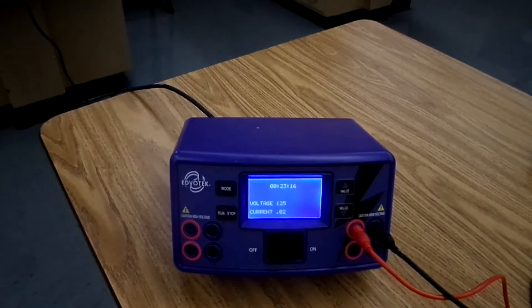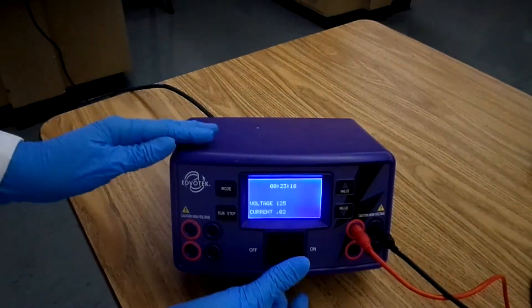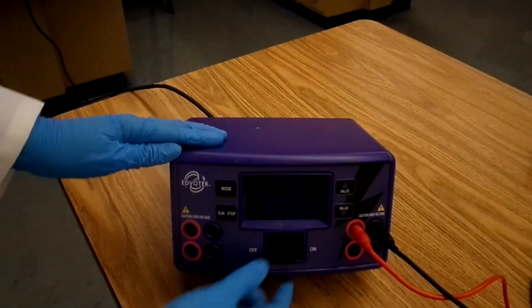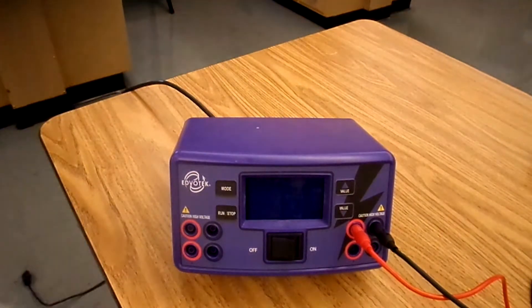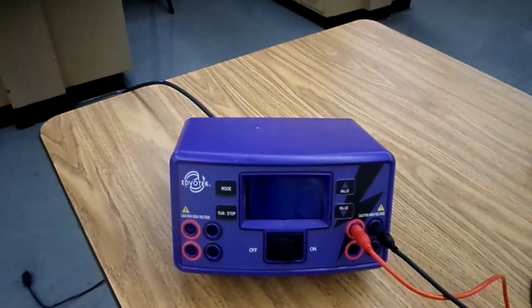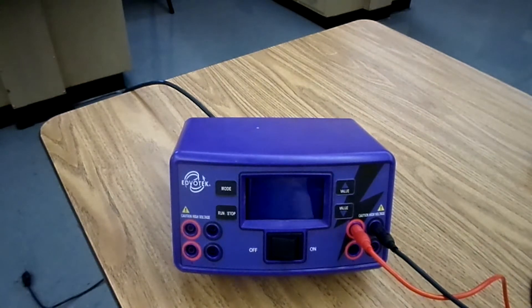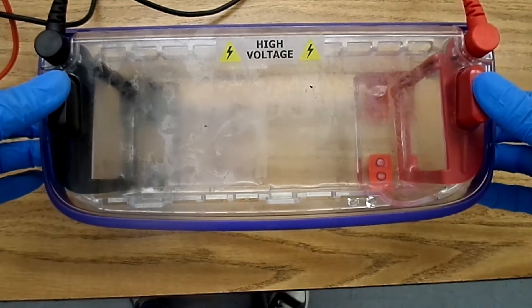We've let the gel run for about 25 minutes. So we're going to turn off, unplug the power supply, and then wait about 10 seconds before we unplug the gel electrophoresis chamber. With everything unplugged, we can now take off the top.